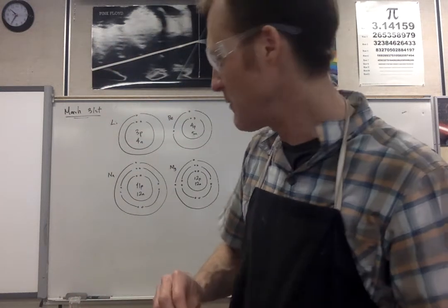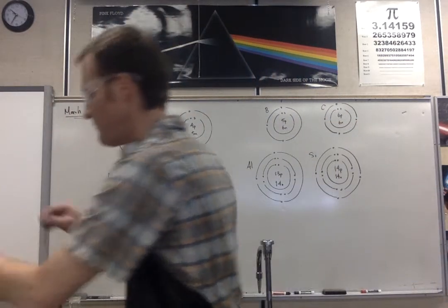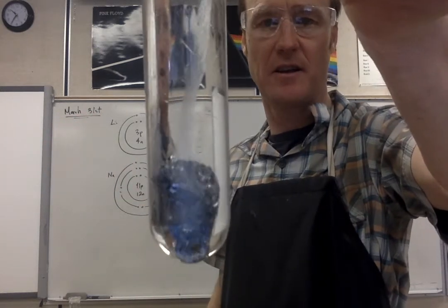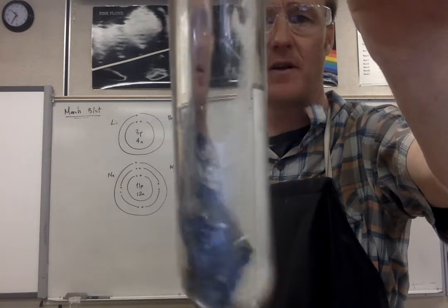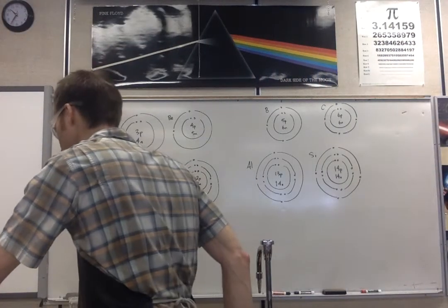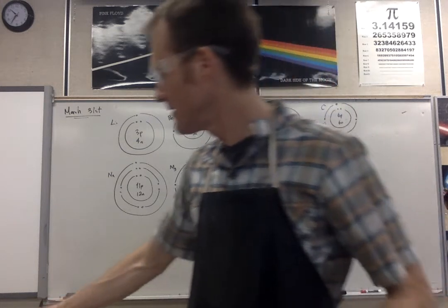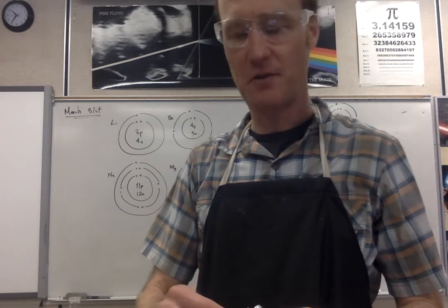I'm now going to add the silicon to the acid. This is a high concentration acid. If acid reacts with silicon, we're expecting it's going to happen now. The next 2 reactions, I'm going to do these in the fume hood.